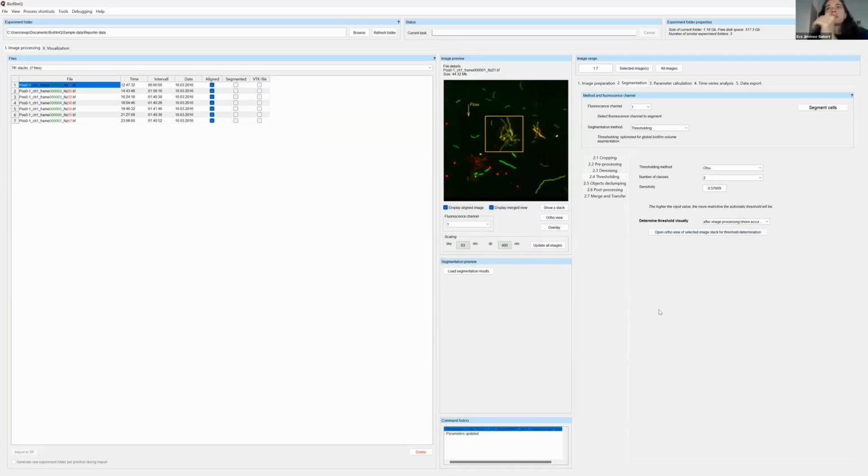And then this is going to select the threshold for every image automatically, so I don't have to do that anymore. So moving on to the next step, this is where you can, after your 3D volume has been segmented, declump it into single objects. This is where you can get your spatial resolution into the parameters that you want to calculate. And you have 2 options here again.